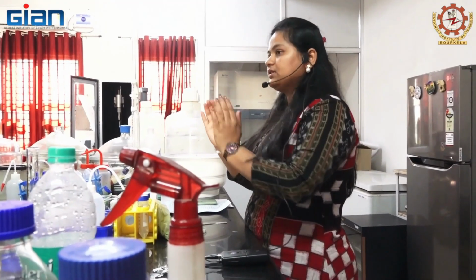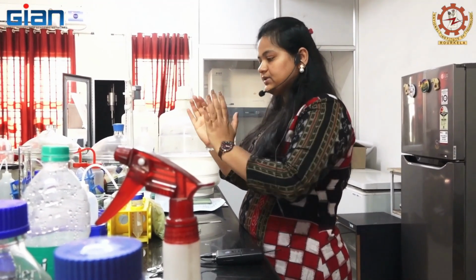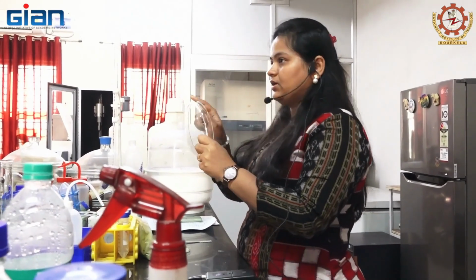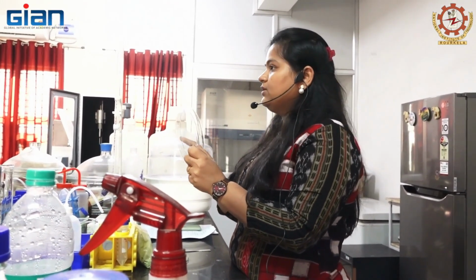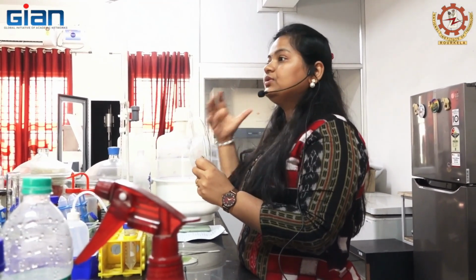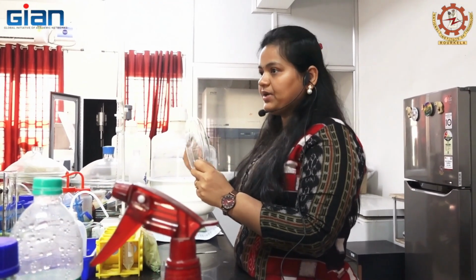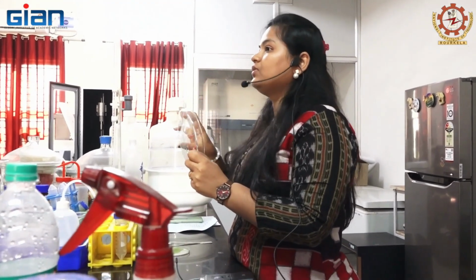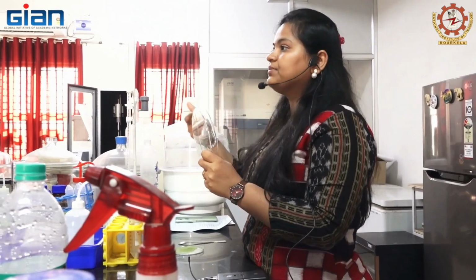You just imagine one cell wall. This is the cell, and this is the cell wall. Adjacent to the cell wall, bubbles are created due to the ultrasonic waves. Due to the heavy ultrasonic waves or high pressure, these bubbles will collapse, and after this collapse the high temperature will rise.